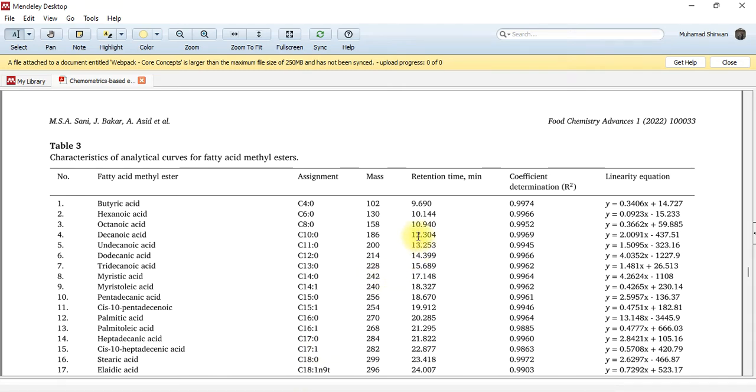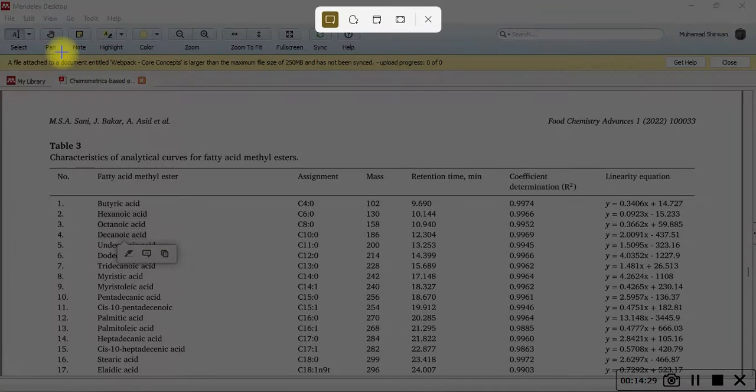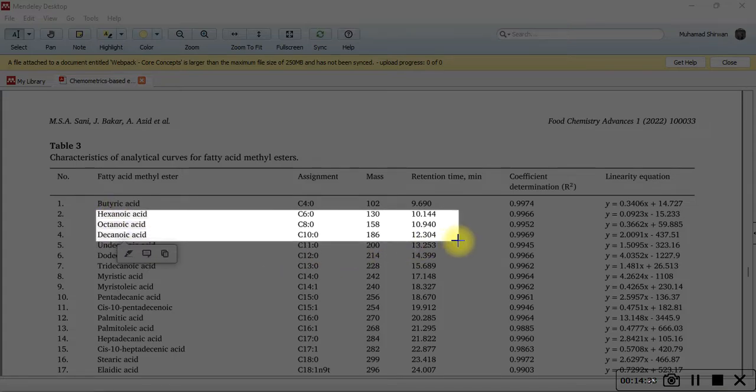10.21. Okay, so I would like to propose we establish three calibration curves for these three compounds: hexanoic acid, octanoic acid, and decanoic acid. Is it okay? For the sake of this workshop. If not, we have to establish 37 calibration curves. You can do it on your own afterward, but I would suggest this one.